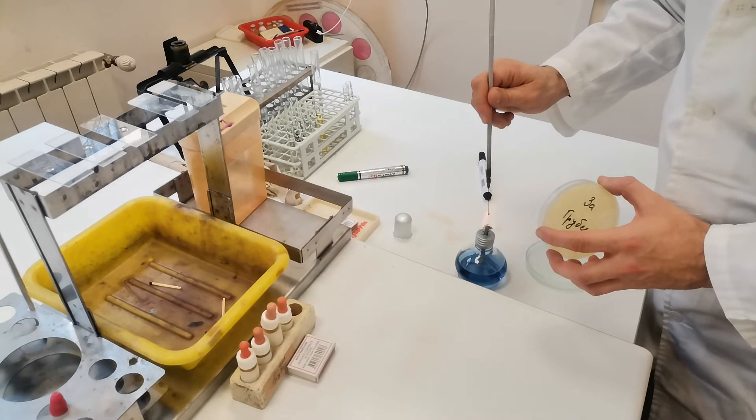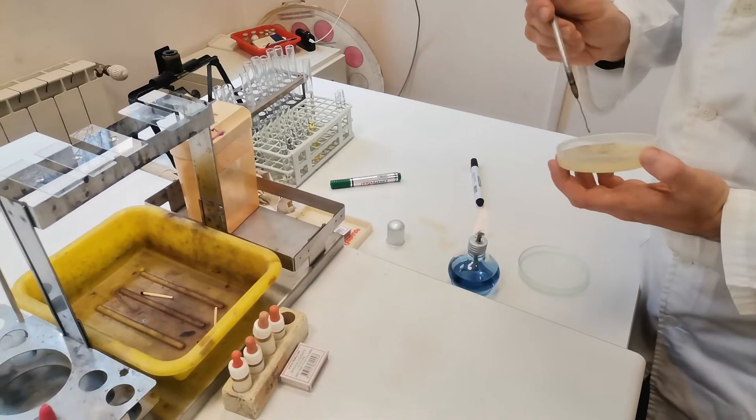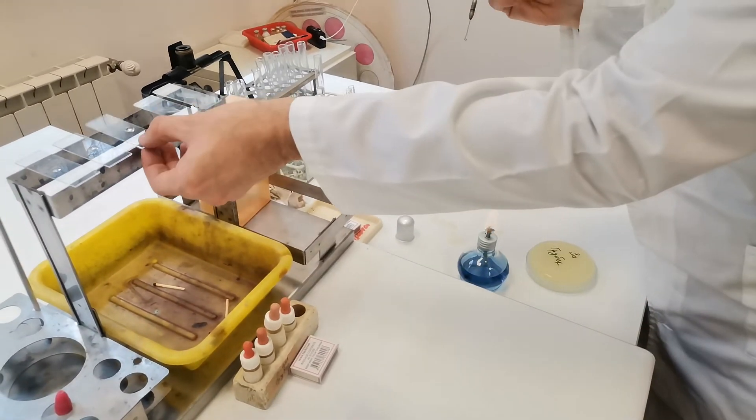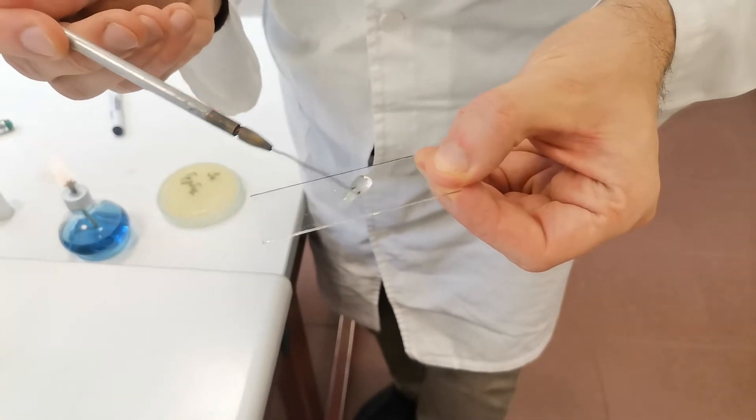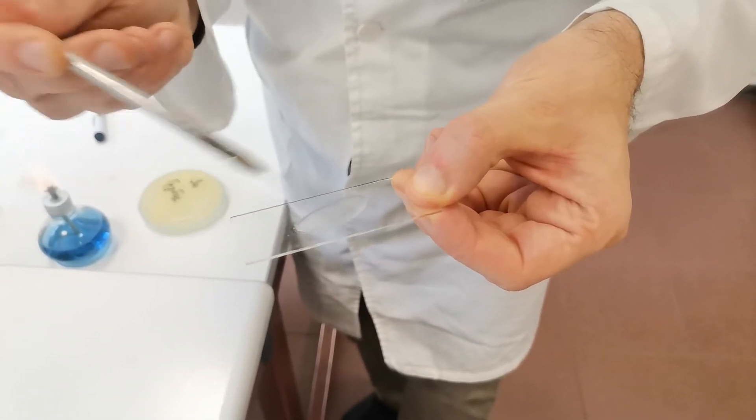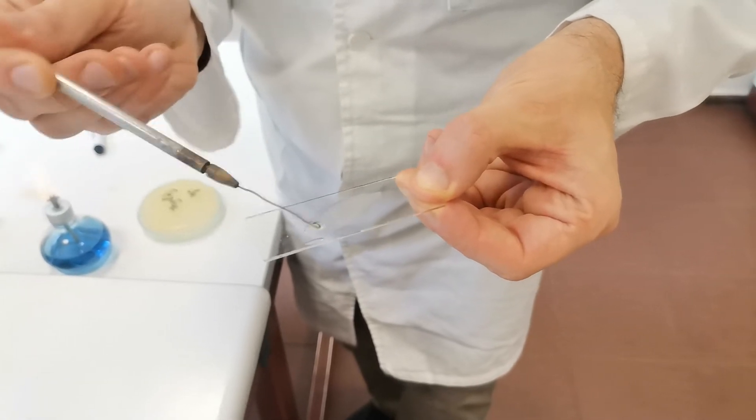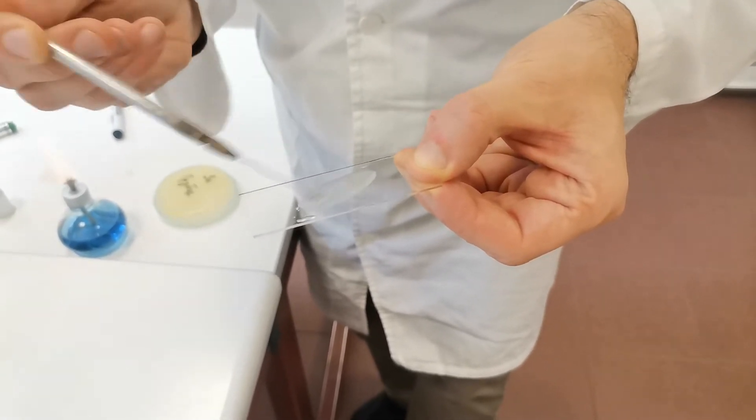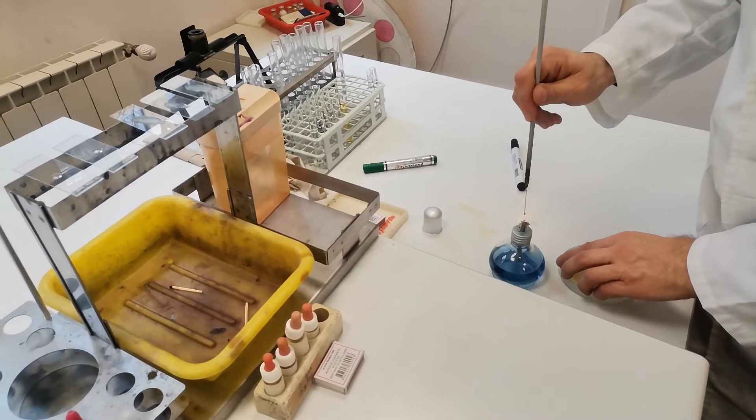First, I need to sterilize the loop, of course. This one stays cloudy. It looks negative at first glance.